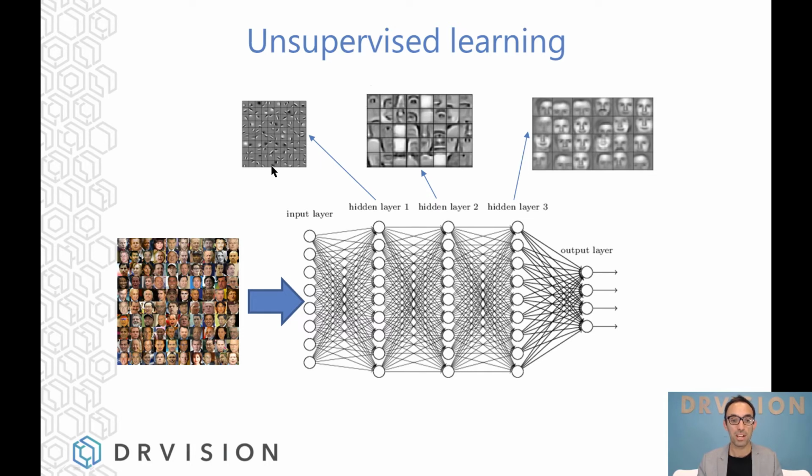In the second layer, the hope is that the features become bigger and start to be more understandable if we could look at them. And the third layer should have faces that will not look exactly like the input, because they are artificially created, but they should look like faces.